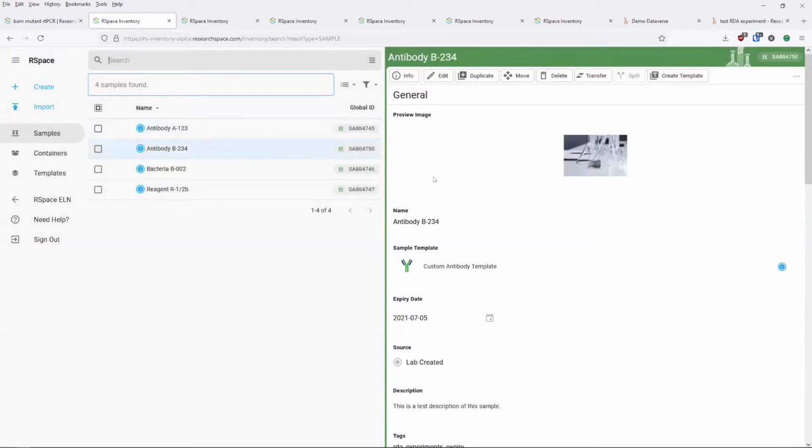And as you can see, as I'm navigating through a little bit here, it is quite, oh, let me just check if, oh, okay, there's just some notifications in chat. Okay, everything's working.